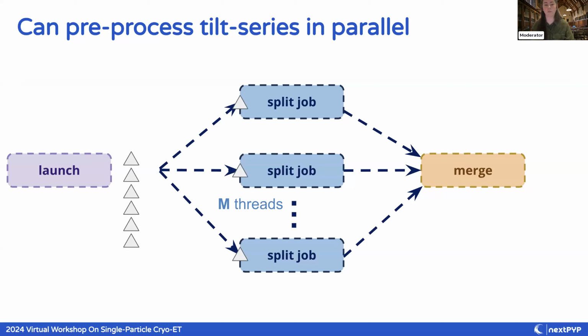And so now these 3 are running in parallel. Let's say for this example, I can only process 3 at a time. That's all the resources I have. But these are going to work and they're going to start processing while the other 6 sit in the queue. And then these are going to finish. And once they finish, they'll know if they either were successful in green here or failed in red.